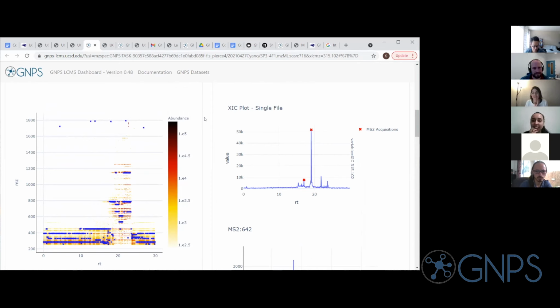I think it really depends on what you want. If you want to only cover the main compounds and get many MS2 to pick the highest quality in a targeted fashion, I think it makes sense to not have dynamic exclusion. If you want broad coverage and as many MS2s as possible of the entire chemical space your sample covers, then I would probably use dynamic exclusion.